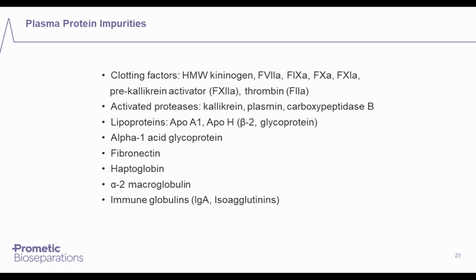Turning now to a more complex medium, human plasma, which contains many thousands of different proteins, a number of which are of interest as a therapeutic product for use in protein replacement therapies. The issue of protein impurities in the context of human plasma purification is interesting, as all the proteins are native to the human. However, depending upon the application for the purified plasma protein, certain protein impurities are undesirable and need to be reduced to very low concentrations.